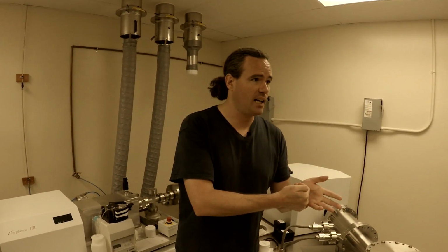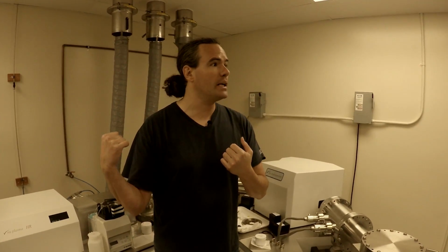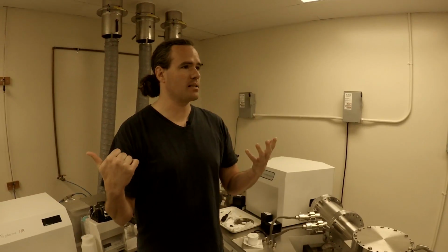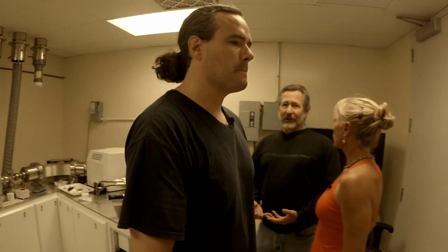Some things are much harder to ionize than others. Strontium is very easy to ionize. Osmium is very difficult. But when you're dealing with an ion source at 7,000 degrees, anything will ionize, including things like argon, helium, neon. So you'll get peaks of all of it. In the mass spectrometer that we saw that measured nitrogen, we're only using a small voltage to do that, 70 volts. And it's at low temperature because it's easy to ionize something like carbon dioxide or nitrogen. It requires something much greater than that to ionize a metal like neodymium or mercury. So it takes a special instrument like this.